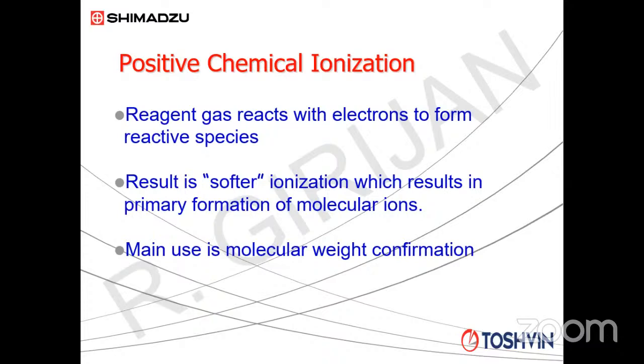Quite expensive also. Now, when you go for a positive chemical ionization operation, you require a separate reagent gas. But that's a very small cylinder. The consumption will be extremely small, and the cylinder will remain for a very, very long time. And why the reagent gas is required, I am going to tell you. And what are the reagent gases that are commonly used in PCI?